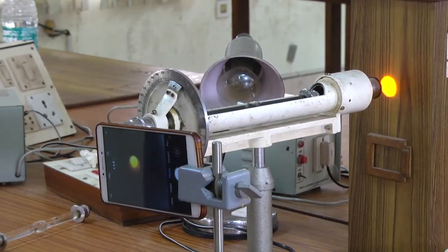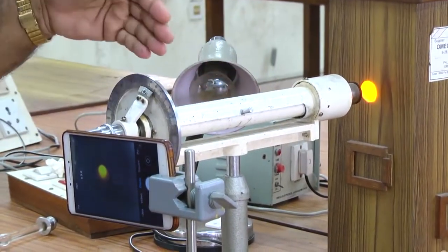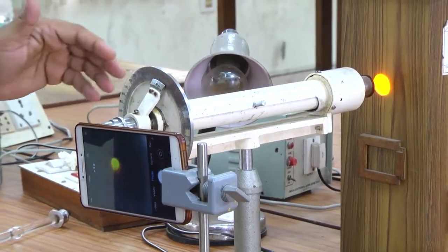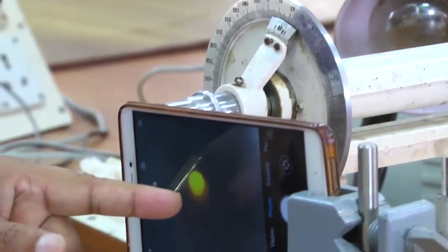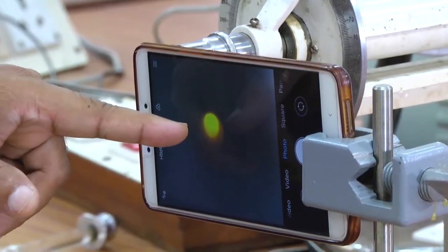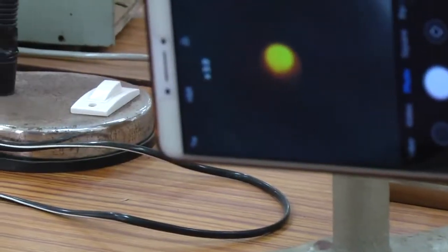Then we have analyzer, and after analyzer we have telescope. Through the telescope, whatever you are seeing from the mobile camera, you are seeing the image of this half shade plate.